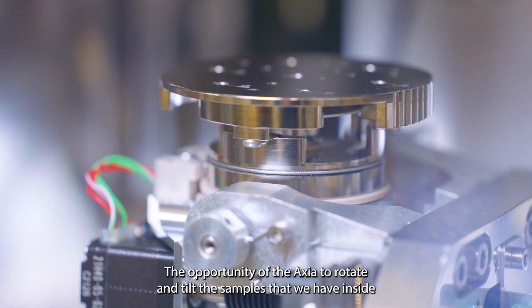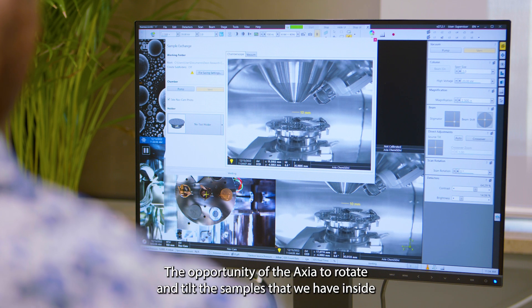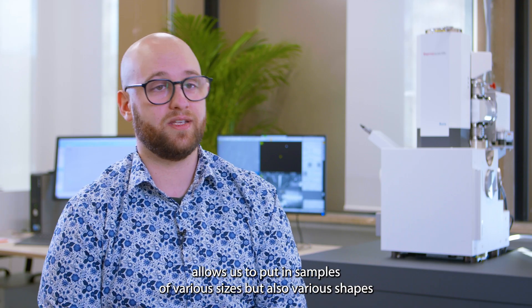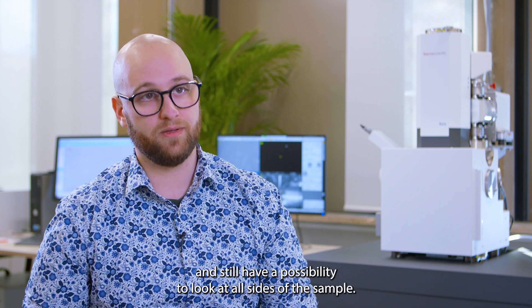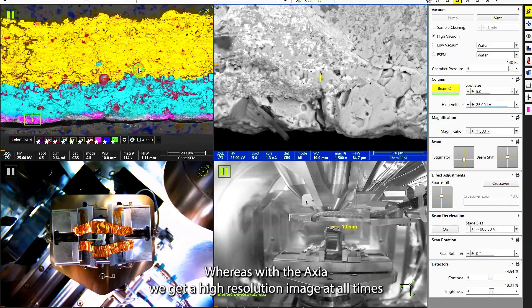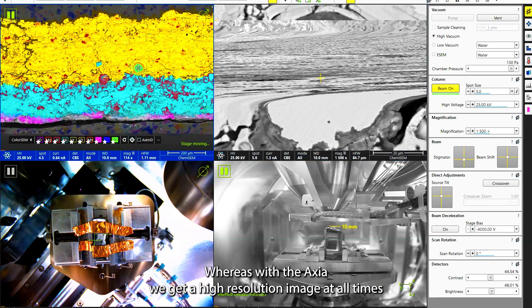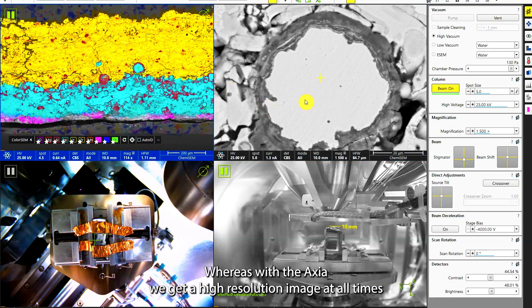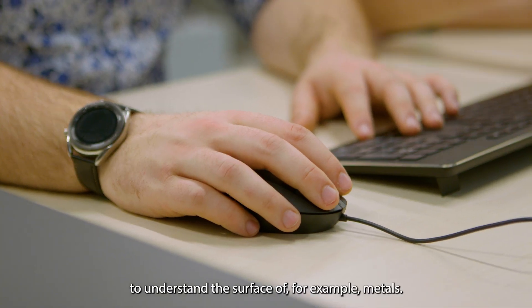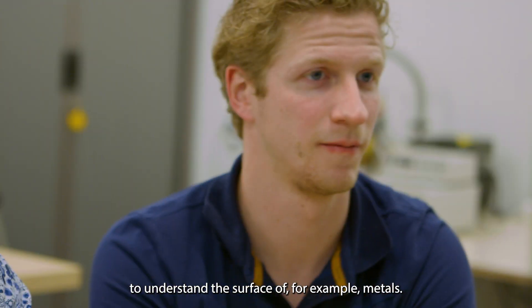The ability of the Axia to rotate and tilt the samples inside allows us to put in samples of various sizes but also of various shapes, and still have the possibility to look at all sides of the sample. With the Axia we get a high-resolution image at all times, which gives us more detail and a better opportunity to understand the surface of, for example, metals.